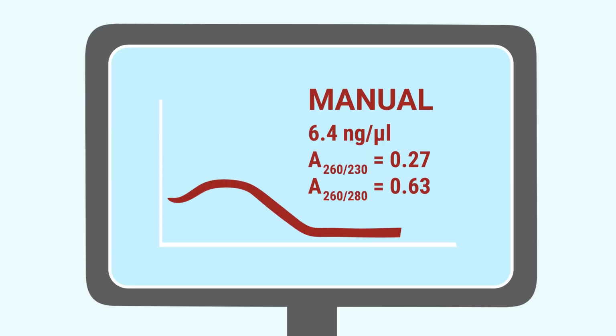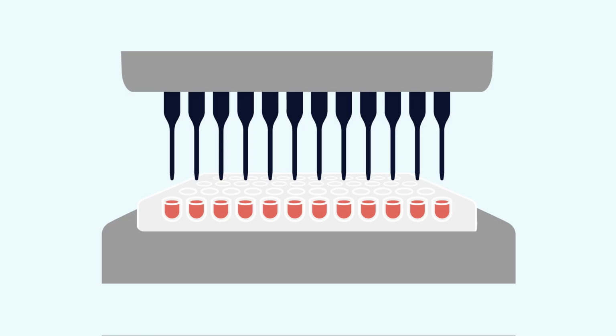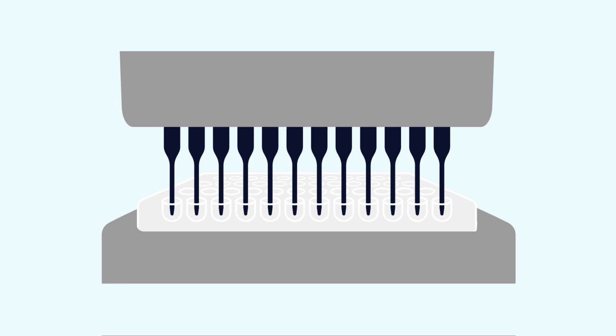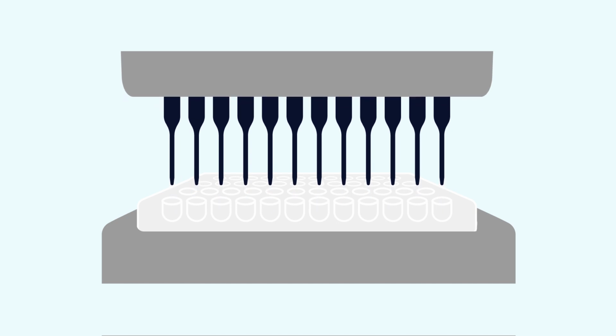When yield and purity are lower than what you would get with the manual method, then you must optimize the most recent automated step. If the yield and purity are acceptable, you can move on to the next step in the workflow. And as you optimize, always keep your process requirements in mind. It's easy to over-optimize steps that will not greatly influence the extraction workflow outcome or your downstream application. But losses in yield also compound over multiple steps. You'll need to decide what is an adequate balance.